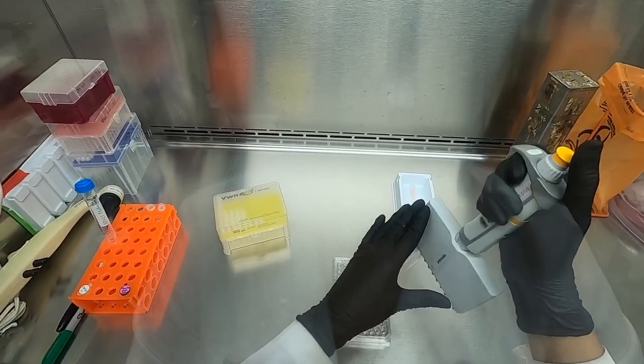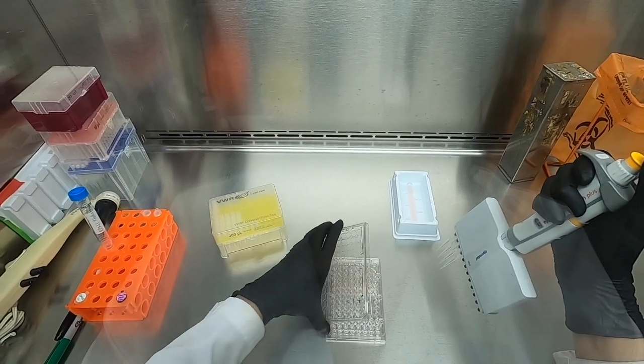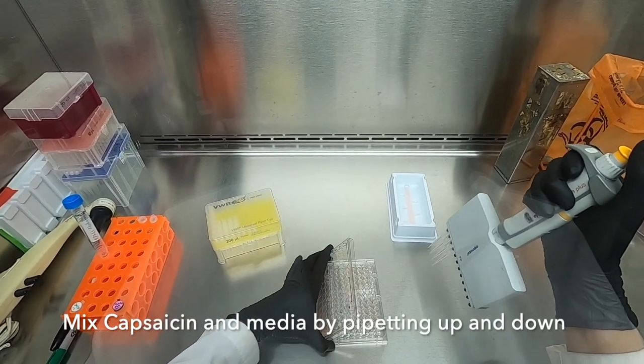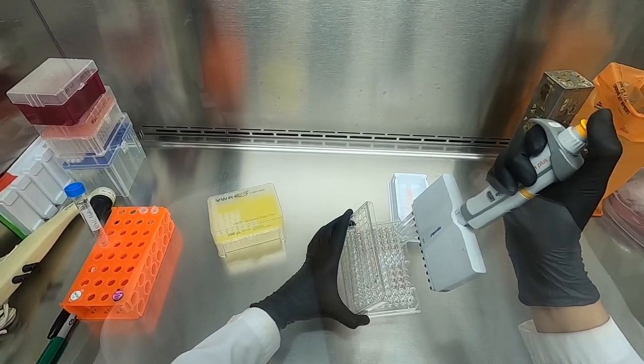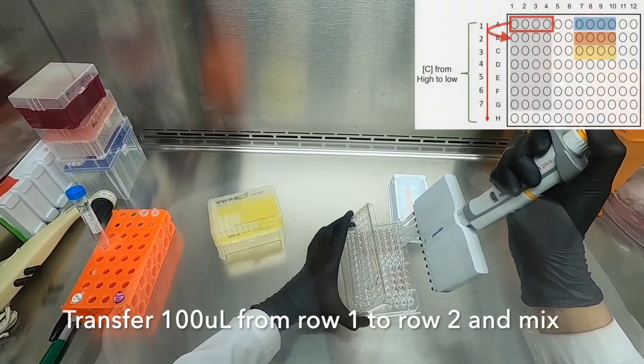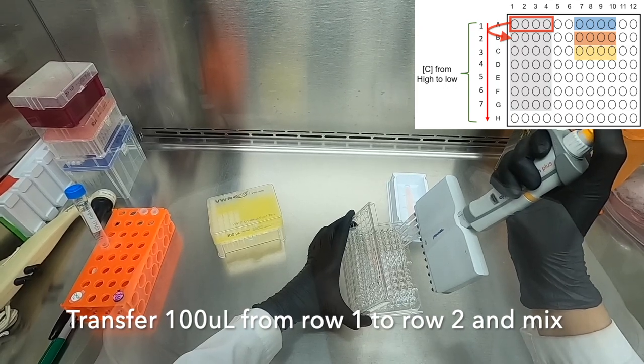Keep in mind that our wells contain 100 microliters of media and we will be transferring 100 microliters from each row to each subsequent row. This means that we will be dividing the concentration in half as we move down our plate.